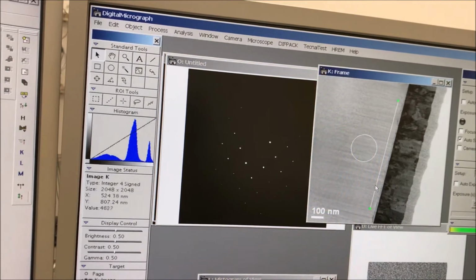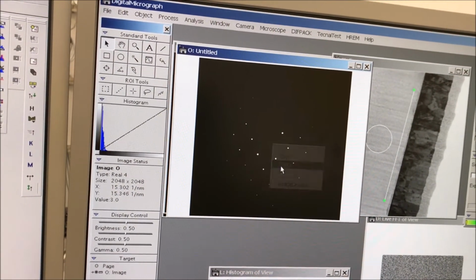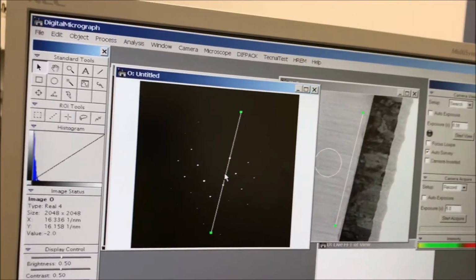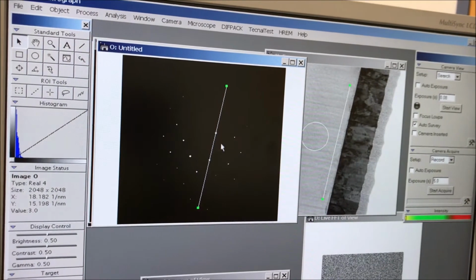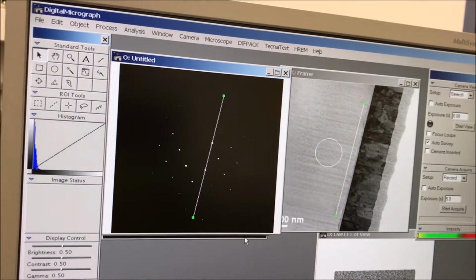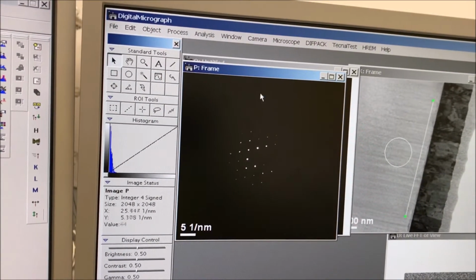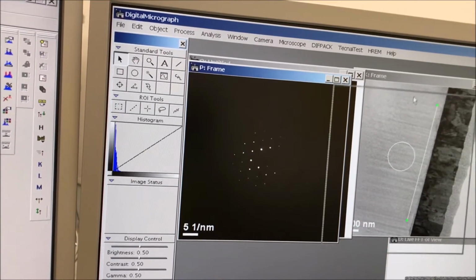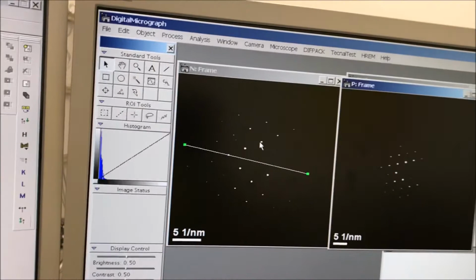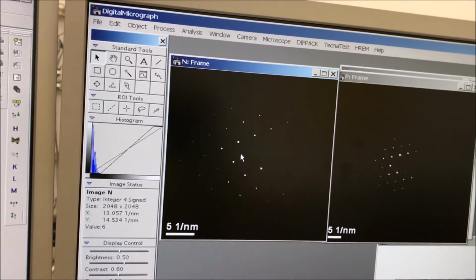And now I can take that line from the image and copy it over onto the pattern. And now we see that I now have the parallelism that I expect. Okay, so we've correctly deduced one calibration. Now again, I know that there is a cutoff camera length where my pattern rotation is different, so I have to do this again for my other camera length regime.